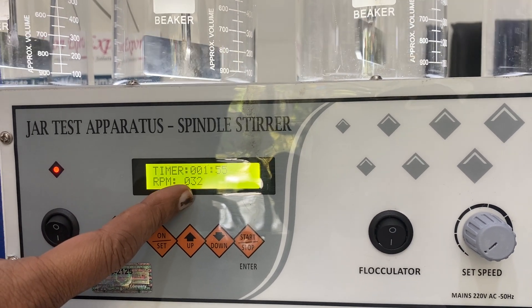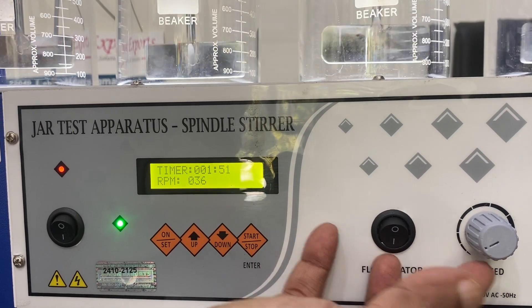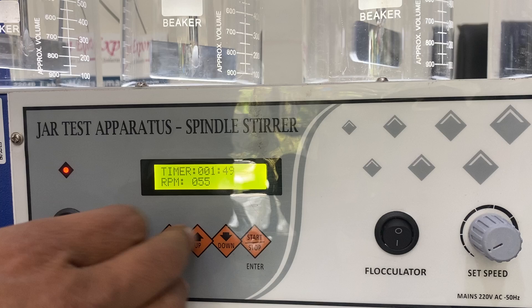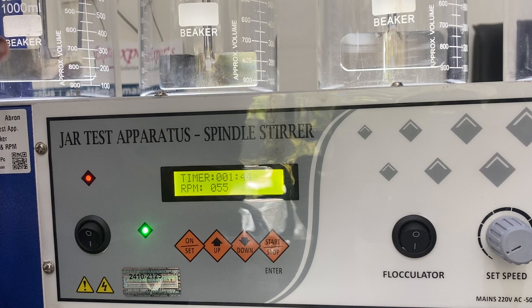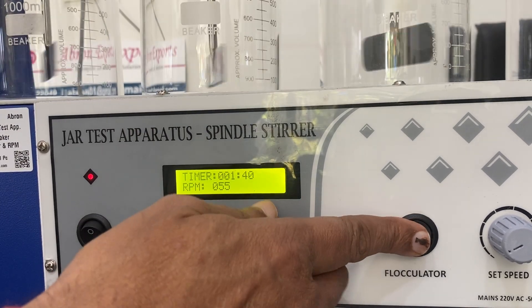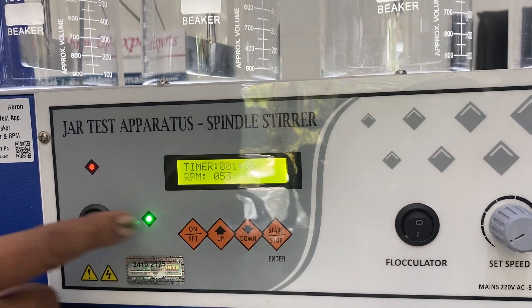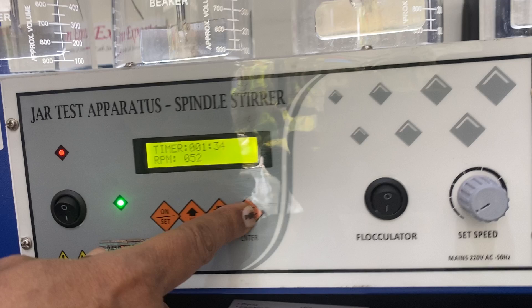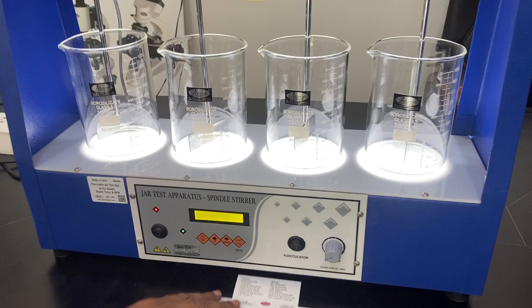This is approximately 32 RPM. This button is for switching the light off, this indicator shows working, this indicator is for the light, and this controls the speed. It is very easy to use. I can switch off and then switch off the whole instrument.